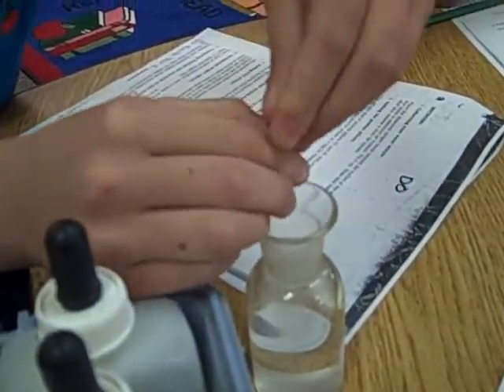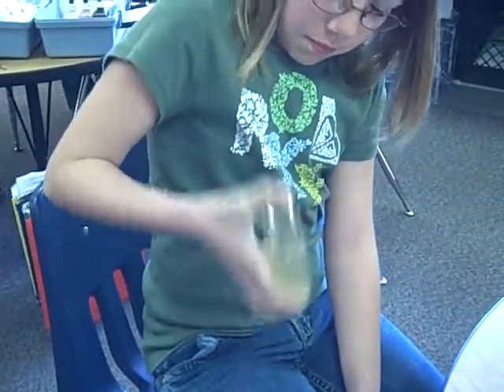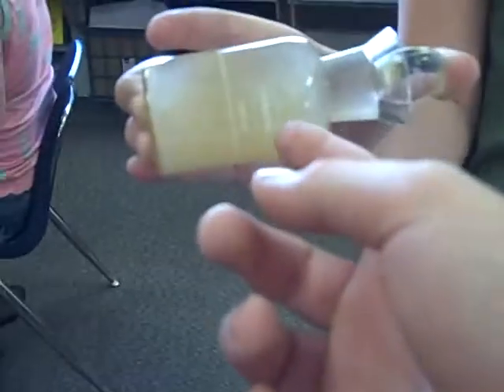Be sure to put your garbage in the Ziploc bag. I'm going to put my thumb on top of the stopper and shake it. You'll see there's a brown material forming — that means there's oxygen in the water.